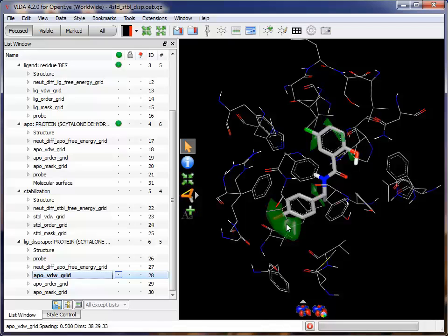Low Van der Waals regions are found in regions with weak polar interactions, and conversely, regions with strong polar interactions have positive Van der Waals energy. The balance between Coulombic interactions and Van der Waals interactions defines the masked or non-clashing region.